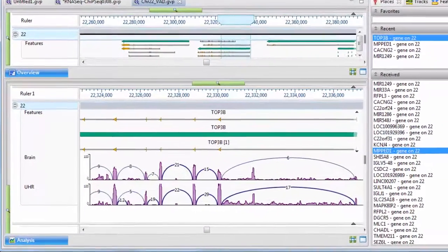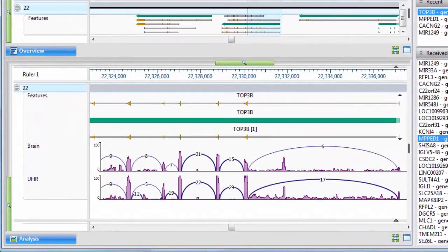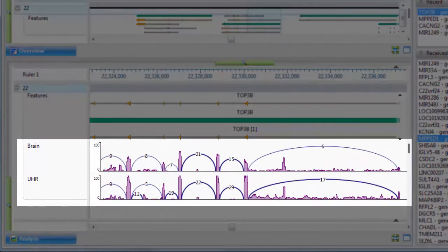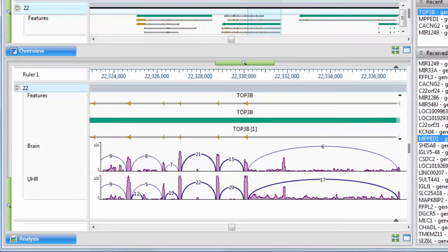Visualize and analyze mRNA isoforms using sashimi plots, which display the depth of coverage for each exon, shown as a bar graph, alongside arcs representing the number of reads split across each junction.